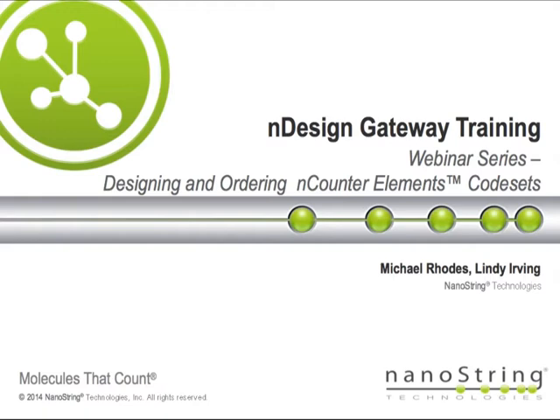In this webinar, we're going to cover designing and ordering a new Elements panel. In a subsequent webinar, we'll cover the options available for reordering an Elements panel.